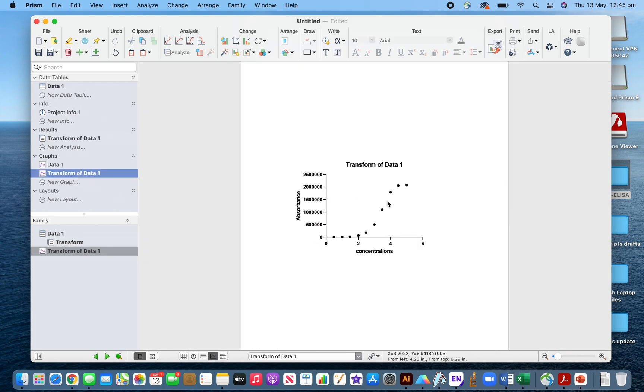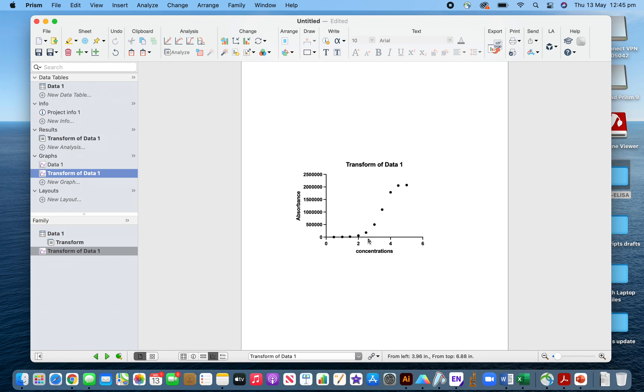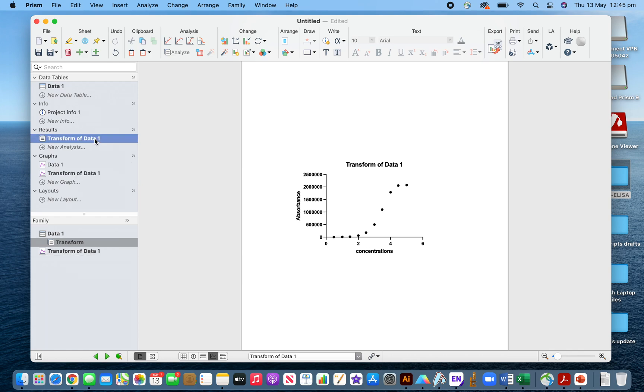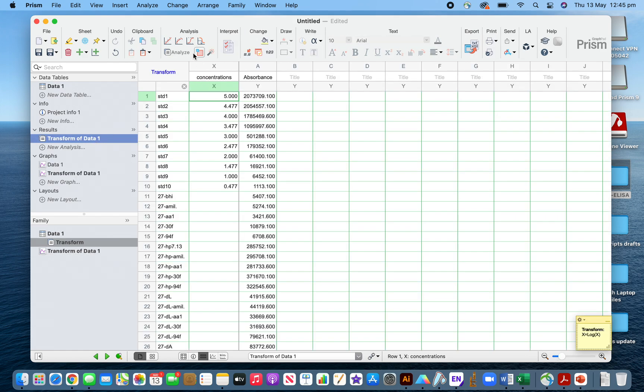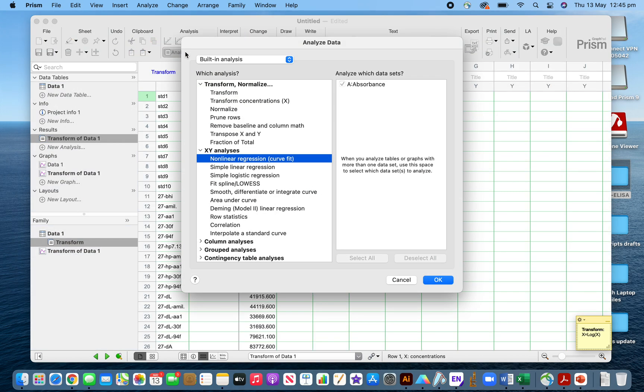Now I will see the plot of that. You see the plot is sigmoidal, so my data, my samples are sigmoidal here for the IL-8 alpha ELISA.